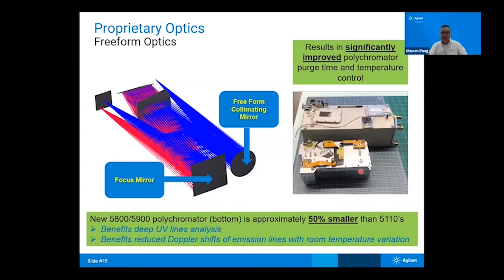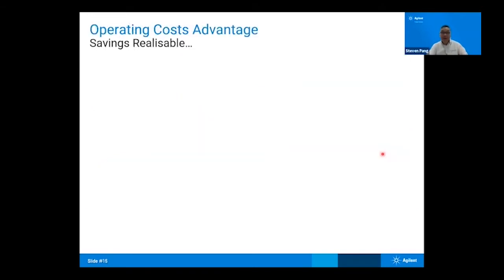And that is also the reason why a lot of ICP-OES manufacturers will tell you, don't switch off your main instrument, just leave it in standby mode, okay? I mention this point because there are some users of ours in Indonesia that, because sometimes the electricity may be fluctuating a lot, they don't want to take a chance and they turn off their instrument. So this feature is extremely helpful when you have those situations.